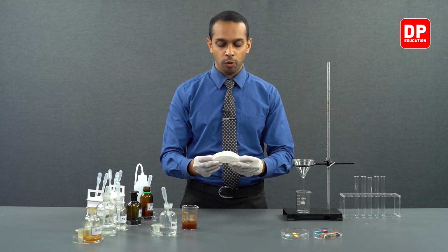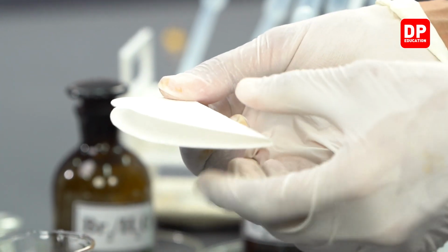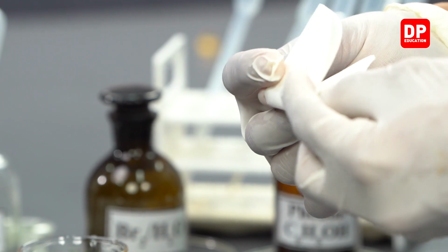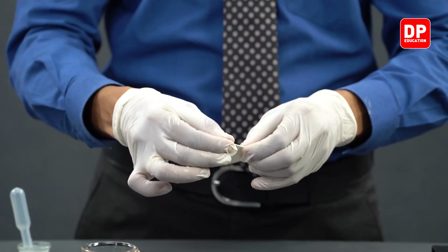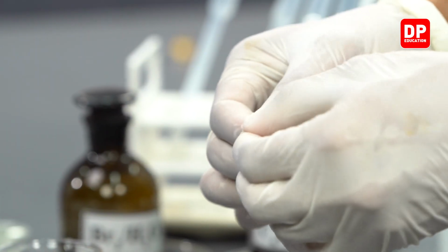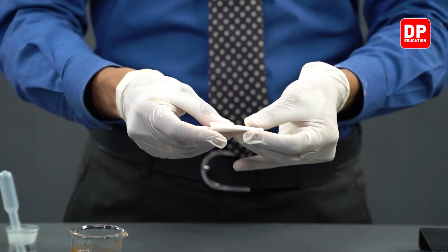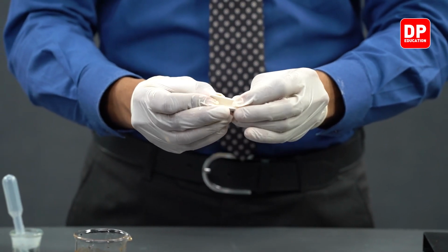We have to fold it once in half like this. Then you can fold it again in half, and you will be folding it once more. You can fold it one more time.